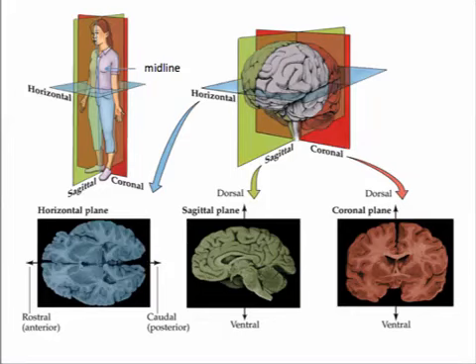So with lab 2, we'll begin to actually dissect our brains. For this lab, we'll be making a cut in the sagittal plane, but overall we'll be making cuts in 3 different planes of dissection. So you'll need to know these planes. The first plane is the horizontal plane, so this cut is made horizontal to our bodies. The second cut is the sagittal plane, and this is the cut that we'll be making this week.